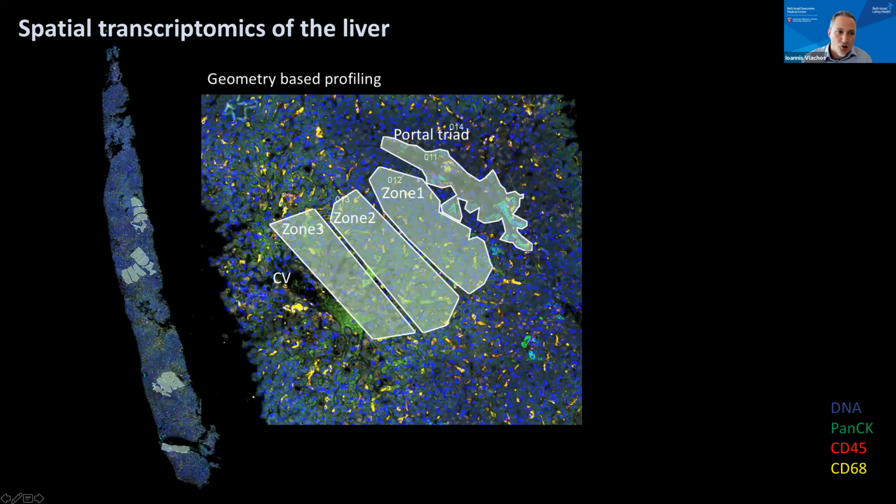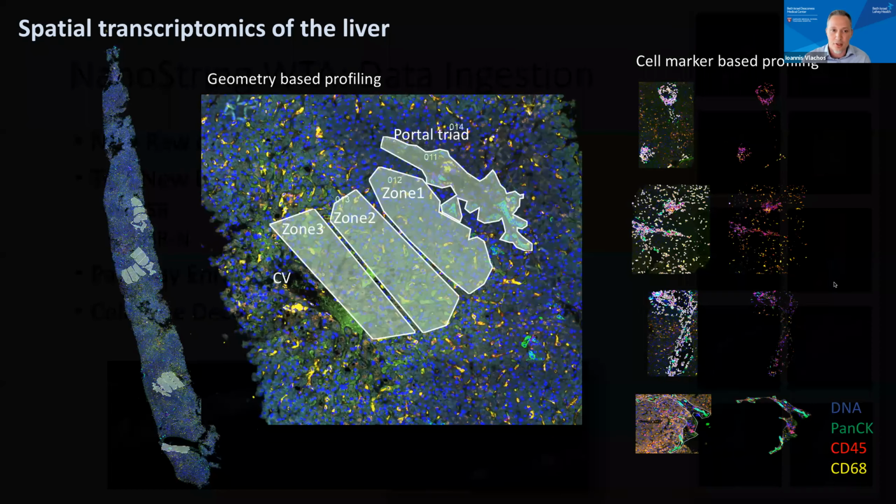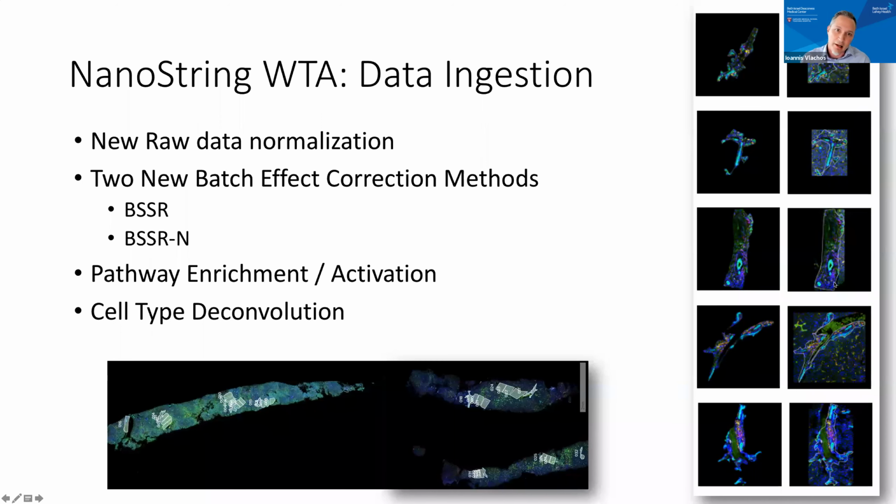and as we mentioned, with regions of interest that really dictate liver function, as well as the ability of increasing the granularity using the markers and sequencing only specific regions, you can get very highly localized information and understand which cells localize and co-localize. And as I mentioned, data ingestion for spatial is very important.